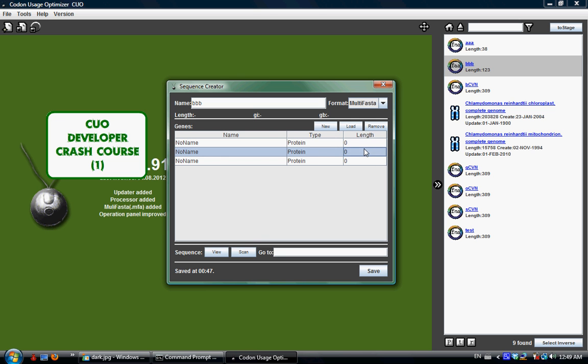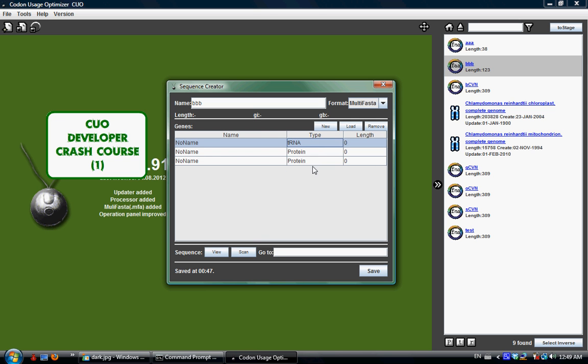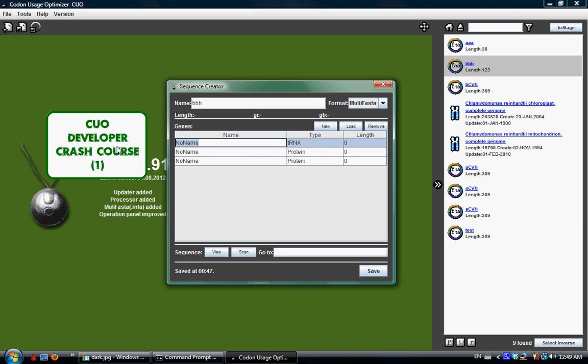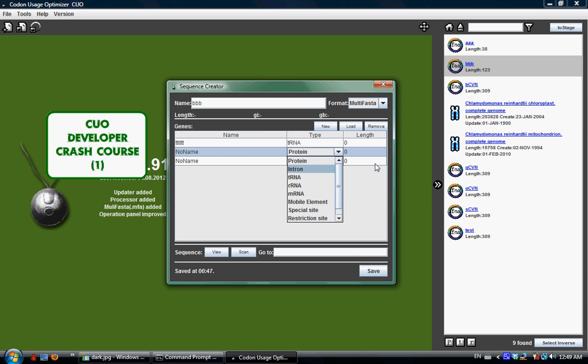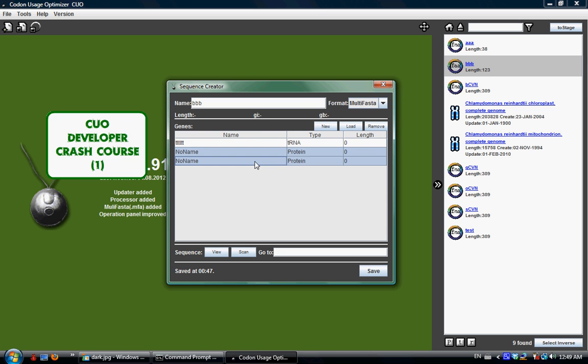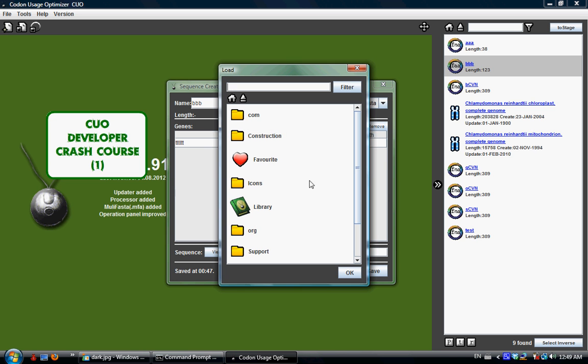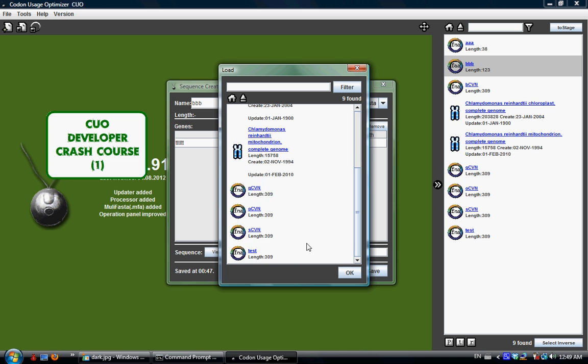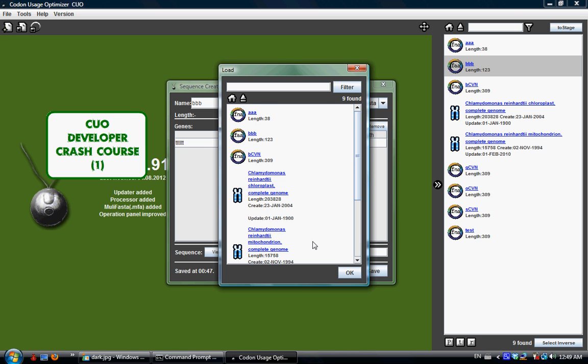This type here you can actually change the type of your fragment to any type you like, let's say to something. Double click the name, you can change the name. Let's say you want to remove this tool, select it and then click remove. Usually what I do is I try to load a few fragments that I like to compile into one MFF file.